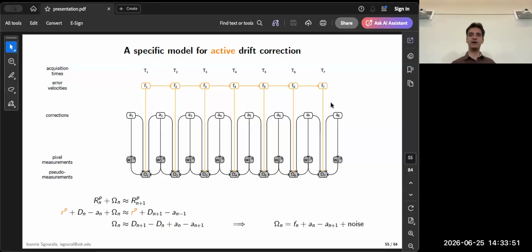And on top, we have the dynamics, the evolution, the time series of successive changes in the drift velocity that, unfortunately, require a very clear assumption. We need a model for those arrows. And I haven't really told you what this model should be. That's what I'm going to do in the next slide.